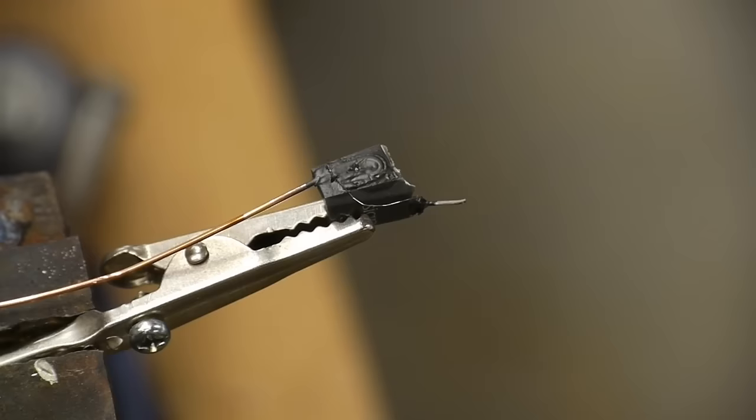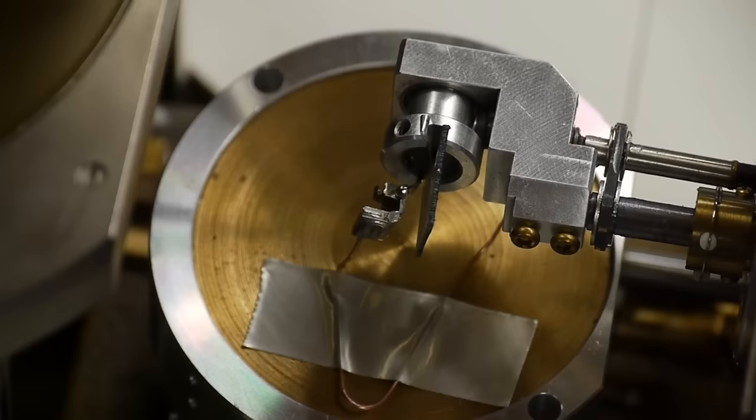Next I needed to make a sort of primitive tone arm that I could put inside the electron microscope chamber so that there would be some amount of tracking allowed, like a little bit of compliance, so that I could push the needle into the record without destroying it, but still have it follow the groove.